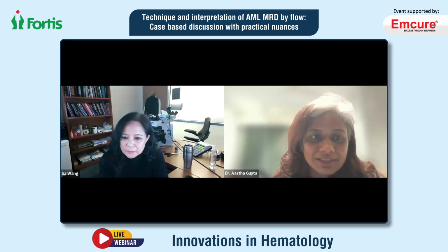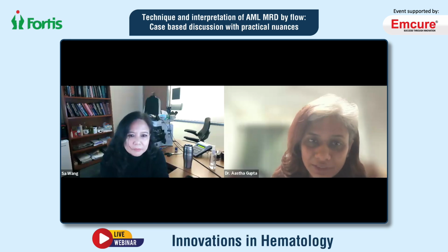Today, the topic of our webinar presentation is the techniques and interpretations of AML-MRD by flow cytometry.